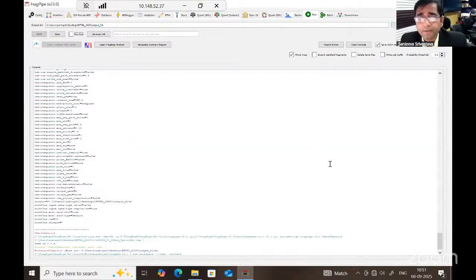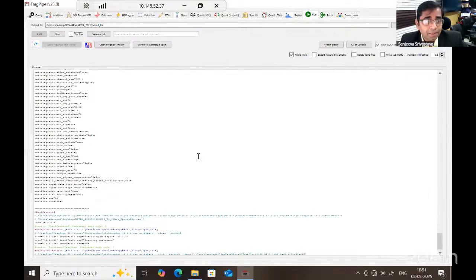All right, great. Thank you, Amit. What students can understand here is how quickly the entire process can be achieved. This file will take maybe half an hour to run, but earlier the same files used to take several hours to a day, and now it can be done in a very short time, in less than an hour.